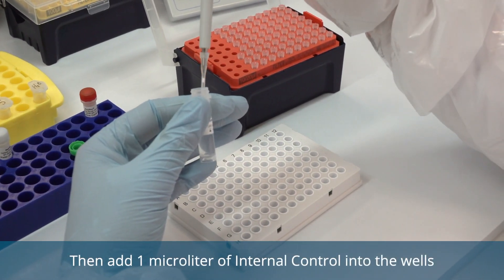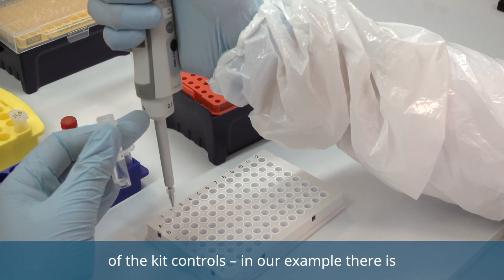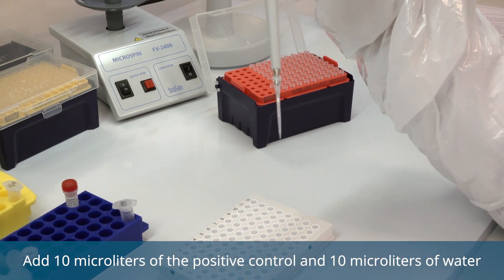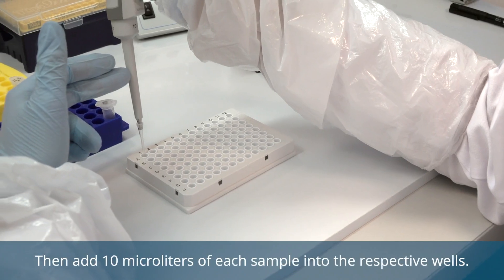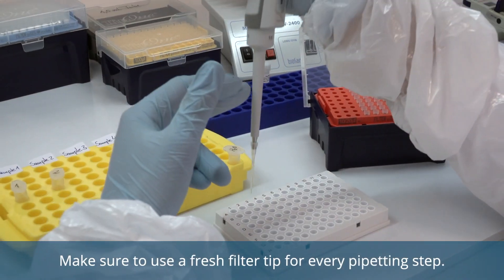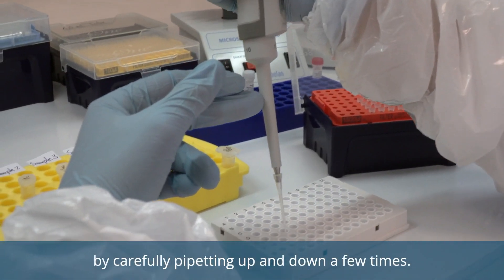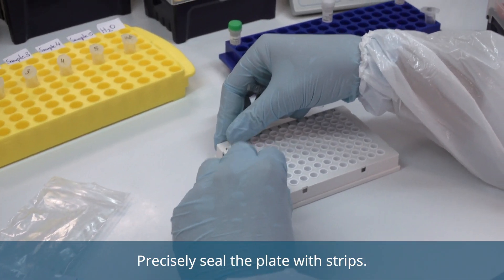Do not miss a well and avoid touching the rim with the tip when pipetting into the wells. Then add 1 microliter of internal control into the wells of the kit controls. In our example, there is one negative and one positive control. Add 10 microliters of the positive control and 10 microliters of water for the negative control into the respective wells. Then add 10 microliters of each sample into the respective wells. Make sure to use a fresh filter tip for every pipetting step. Thoroughly mix the samples and controls with the master mix by carefully pipetting up and down a few times.